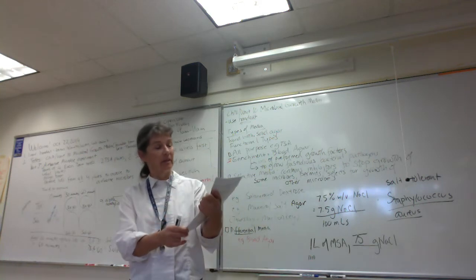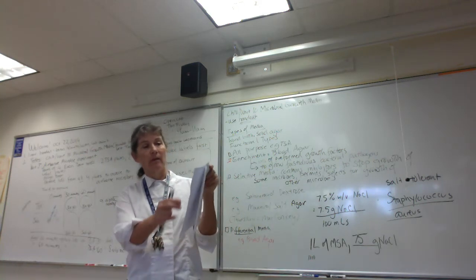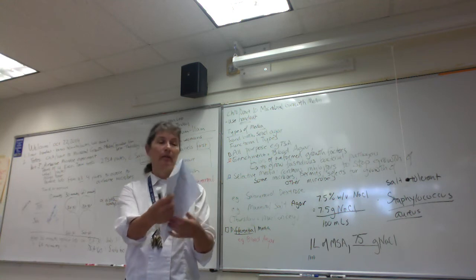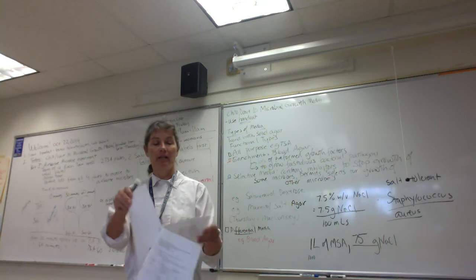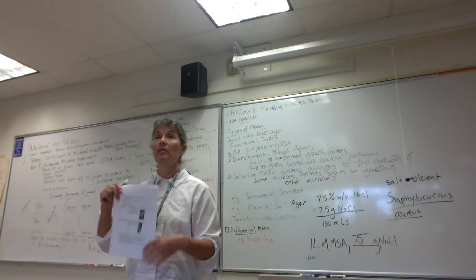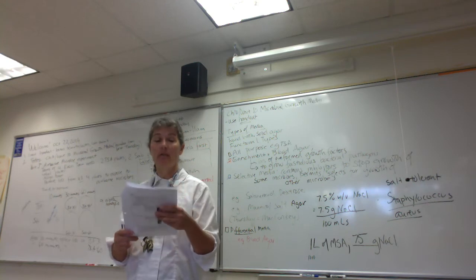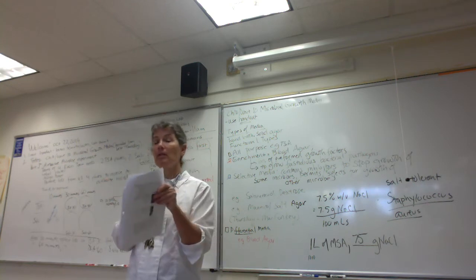And let's see here, the discussion, folks, of the hemolysis is going to be on page 1, 2, 3, 4. And folks, this handout is on Canvas and it's in color. So it's going to be such a helpful study guide when you get ready for lab exam 2. So guys, page 4 says blood agar. So the first type of hemolysis, you guys, is what?